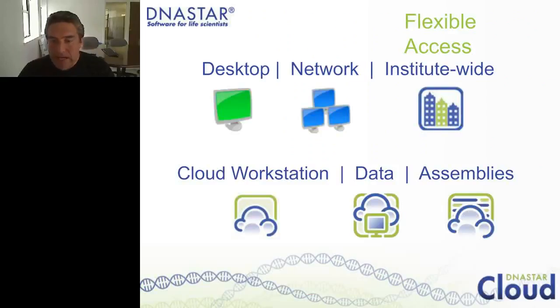So with that, I'd like to just summarize a few things, and I said I would get back to licensing options. Again, if you already have access to the software, this is just some new information for you. But if you don't have access, there's different types of licenses. We have desktop and network and institute-wide. We have cloud workstations. Feel free to contact me with any questions that you have about either the function of the software or the way that you can access it.